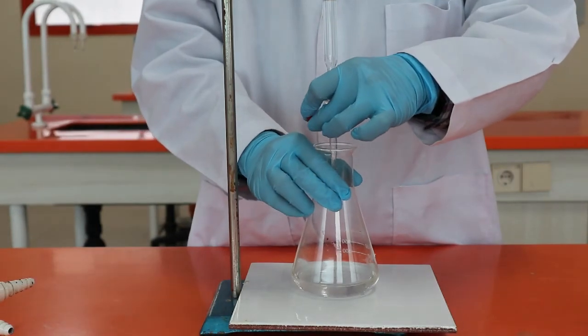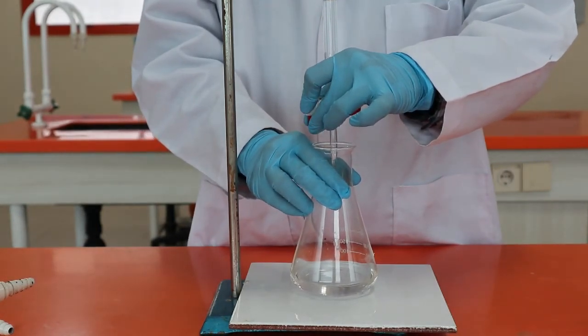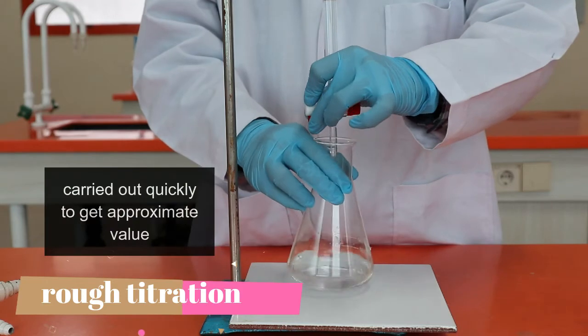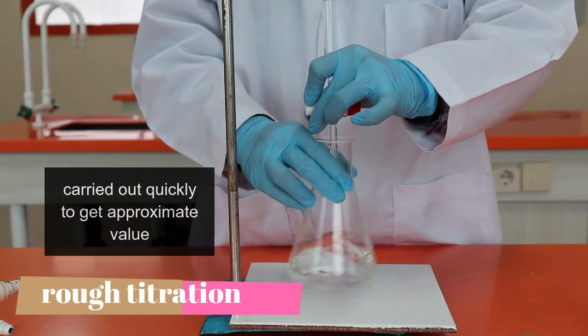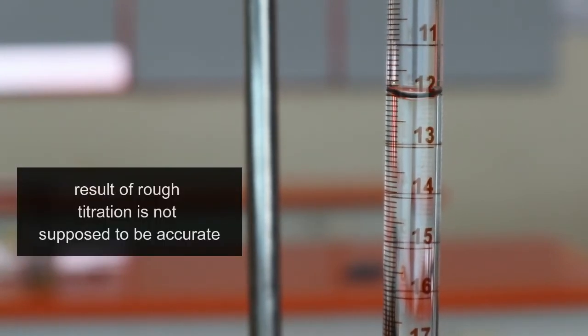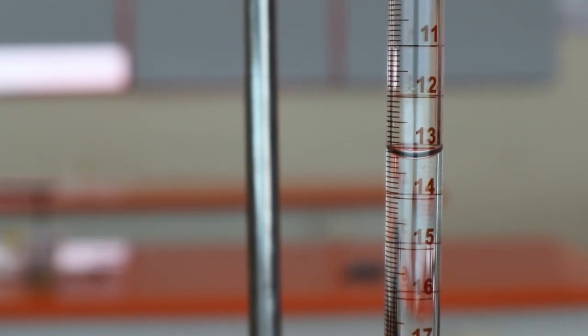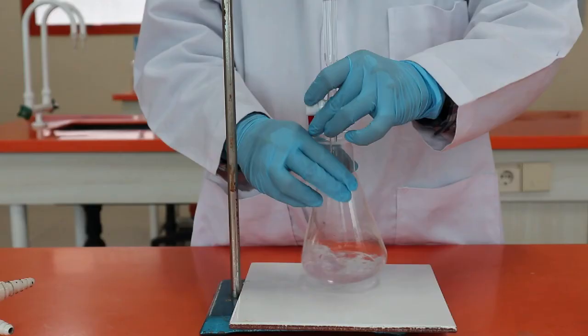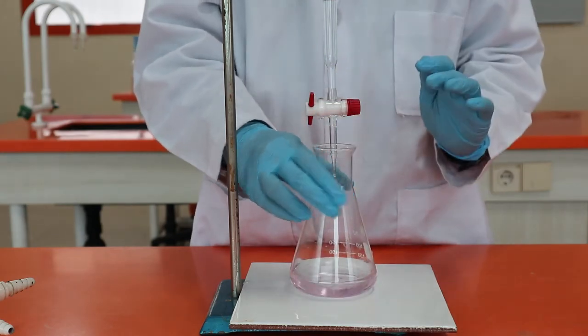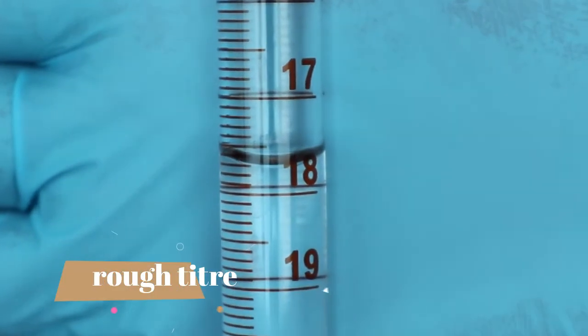For higher-grade chemistry students, an even more accurate titration is usually required. The rinsing procedure is pretty much the same for every grade level, but for a more accurate titration we will start with a rough titration. Rough titration is carried out quickly to get a rough idea of the approximate volume needed to reach the endpoint. The result will not be included in the accurate titration data. I do this by quickly draining each centimetre cube of solution until the pink colour appears. The value will be too large since it is unlikely to have stopped exactly at the endpoint.